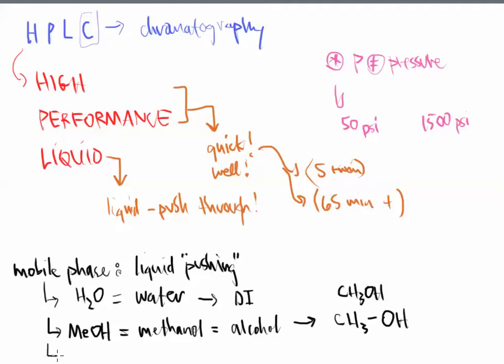Finally, the third common mobile phase is something that we call acetonitrile.